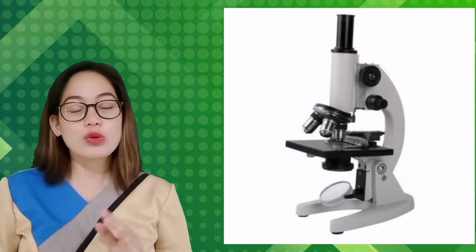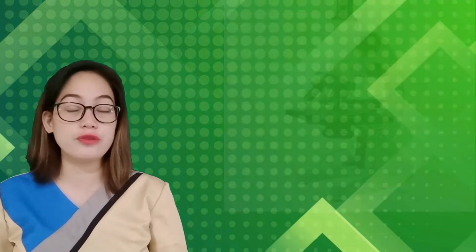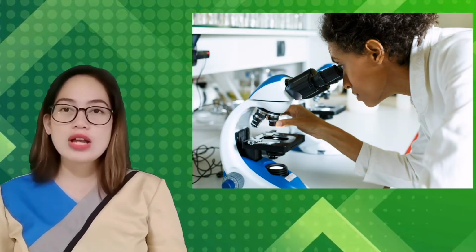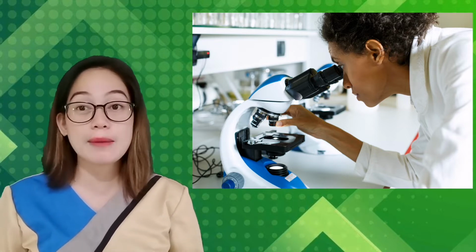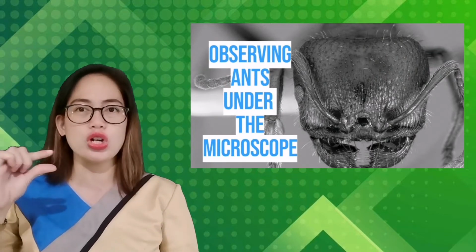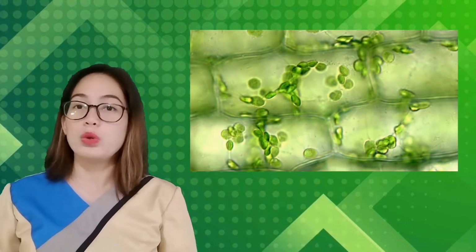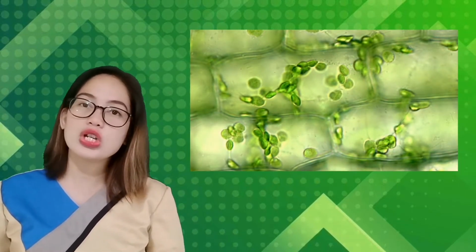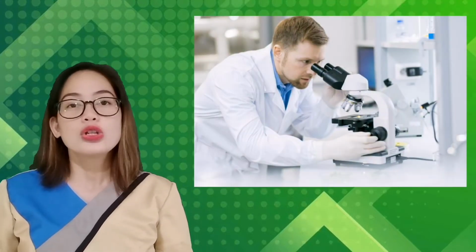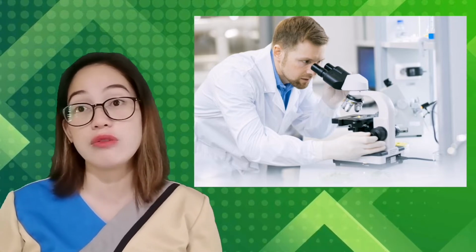Okay, very good. A microscope is a portable but very powerful tool in the field of biology. It allows us to view an object or sample, what we call the specimen, at its tiniest detail and provides us with essential data about the existence of things with life. In fact, the recent pandemic introduced us to a new strain of virus, COVID-19. Through the use of the microscope, scientists were able to see the structure of the COVID-19 virus.